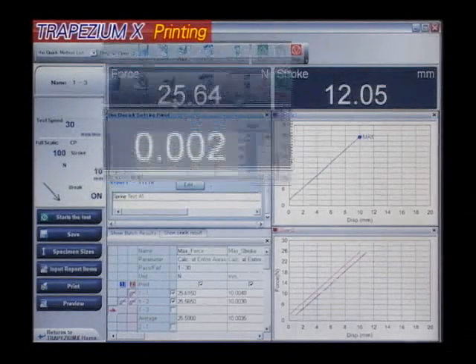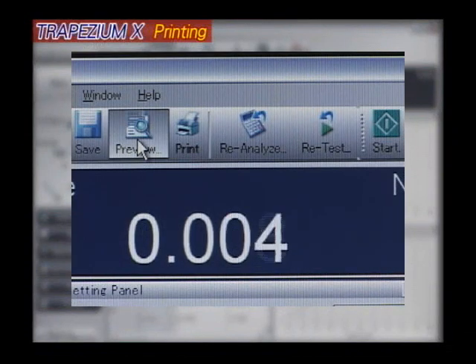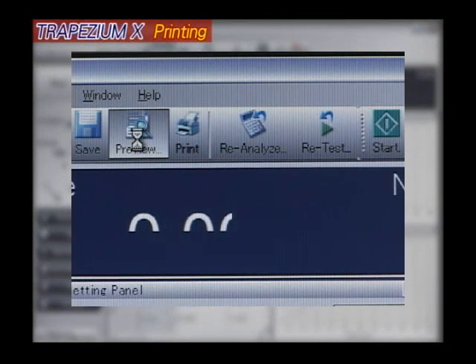Report layout can be specified in advance, allowing reports to be printed with a single mouse click.